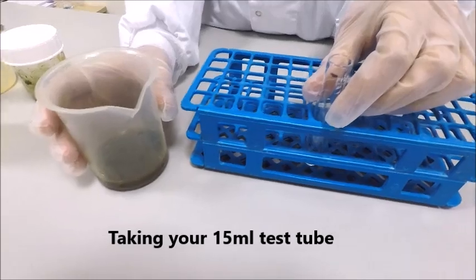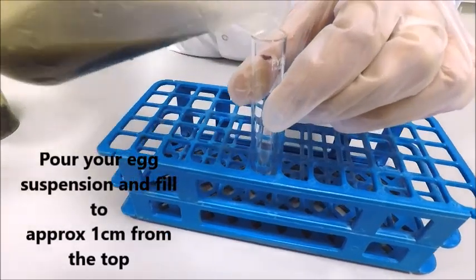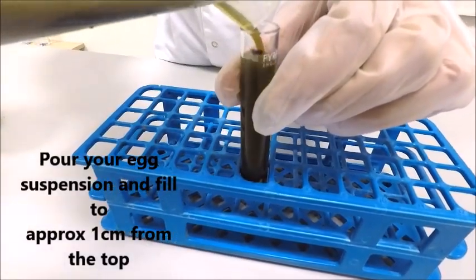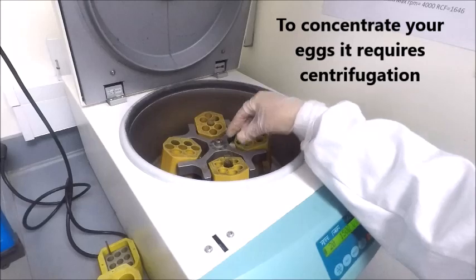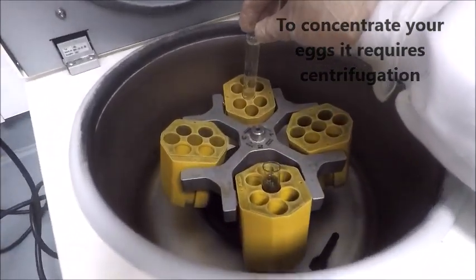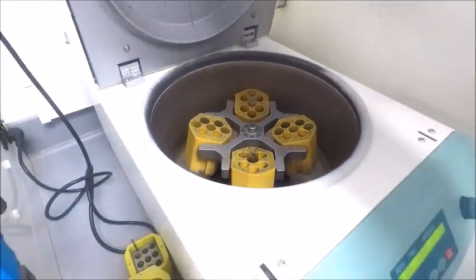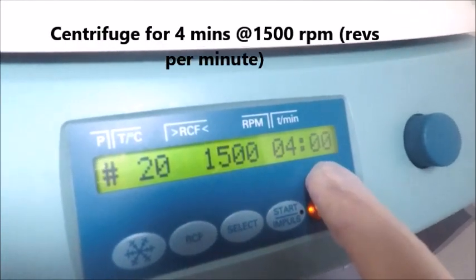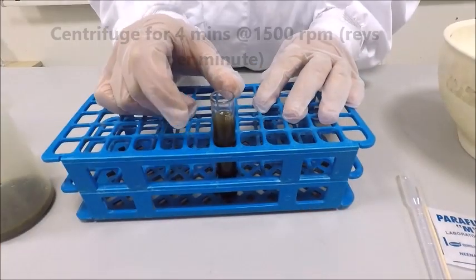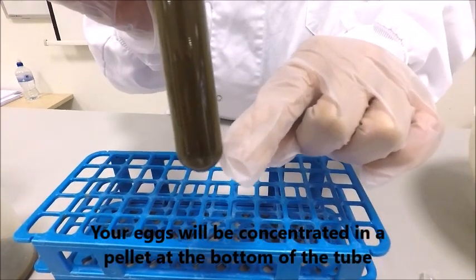Taking your centrifuge tube, fill it to 1 centimetre below the top. In order to concentrate your eggs, centrifugation is required. When using the centrifuge, ensure that both tubes are balanced. Centrifuge your sample for 4 minutes at 1500 revs per minute. Your eggs will now be concentrated at the bottom of your test tube.